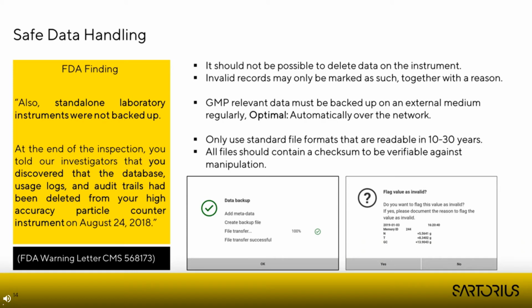This warning letter contains two important statements related to data handling of a standalone instrument. On one hand, it was possible to delete data like the audit trail, and on the other hand, the data could not be restored because no backup was created.